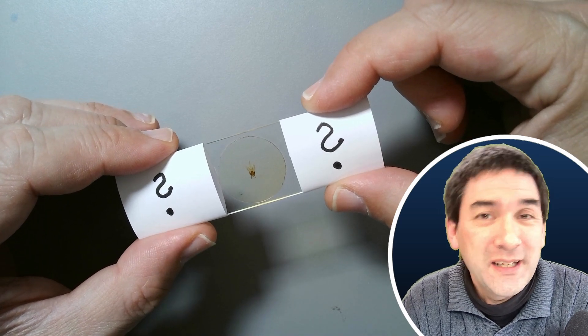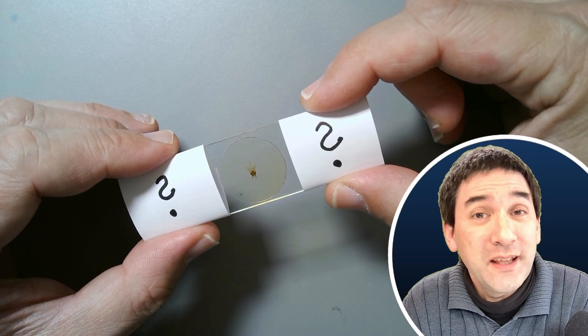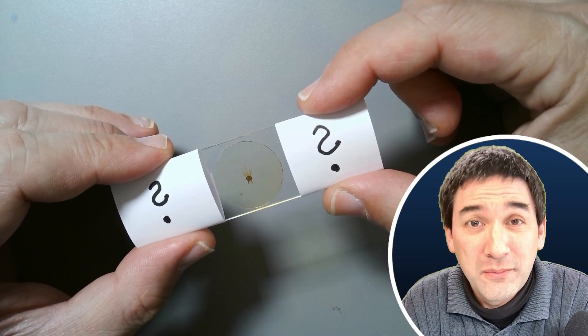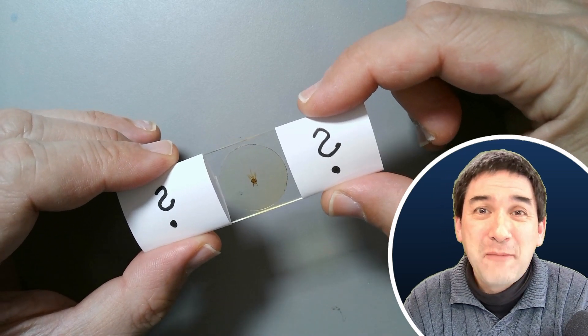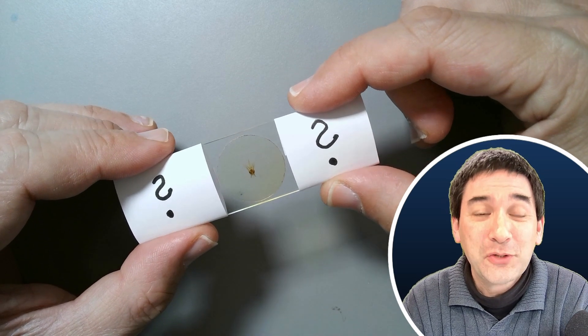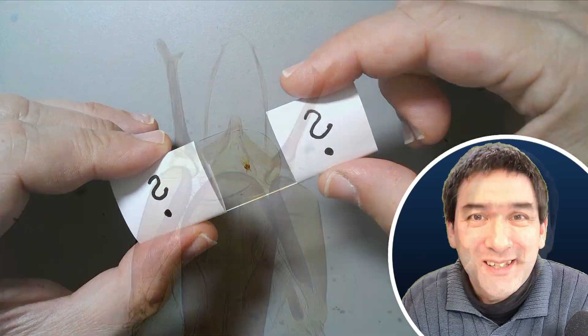It is again an antique microscope slide, probably from the last century, maybe over 100 years old. I think it is one of the most pretty specimens of this kind that I've got. Back in the 19th century, people spent quite a bit of energy and time to prepare those microscope slides. I'm going to put it first under the microscope, and then I'm going to reveal what it actually is.